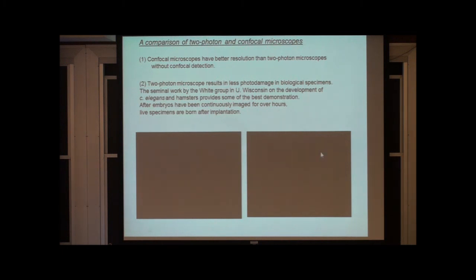On the other hand, if you do two-photon imaging of the euglena, this is the one on the right, you can see the euglena come by, bounce off the labels, and swim off again. We imaged about 30 euglena and they don't die. So why is two-photon better? The reason is not that there is no damage within the excitation volume.